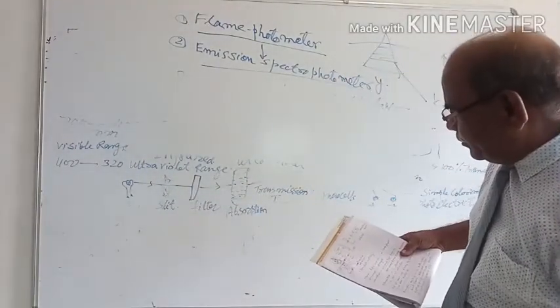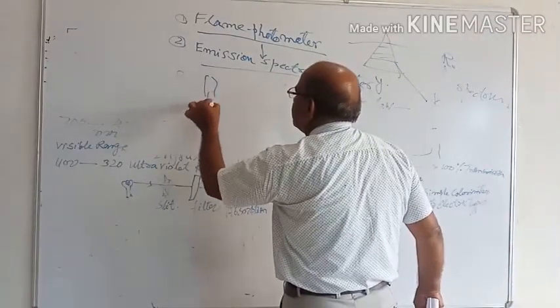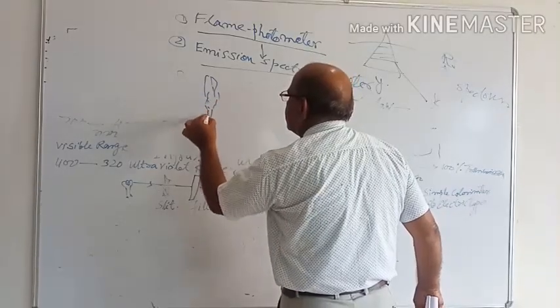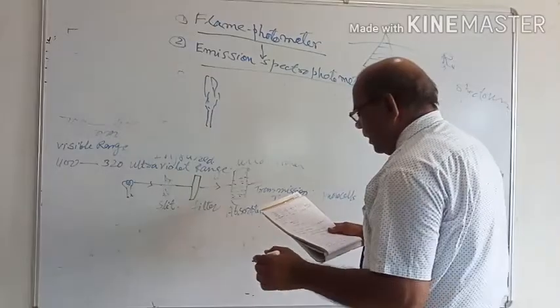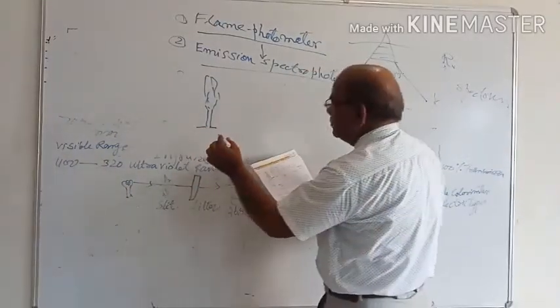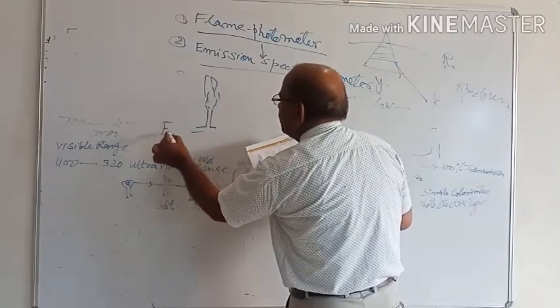You see, here is a flame, and through this flame we pass fluid.